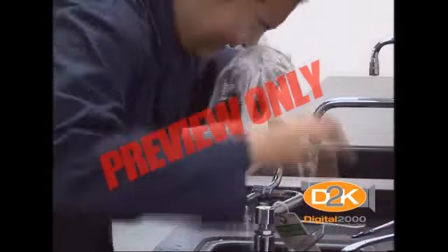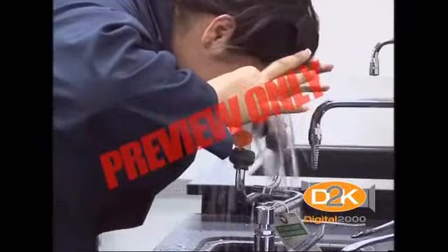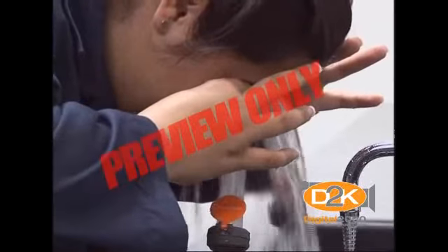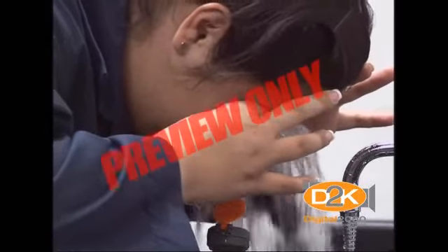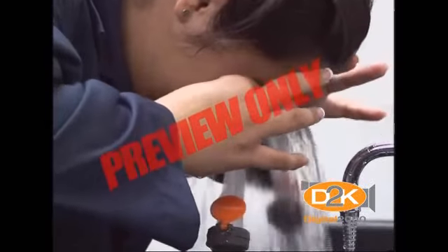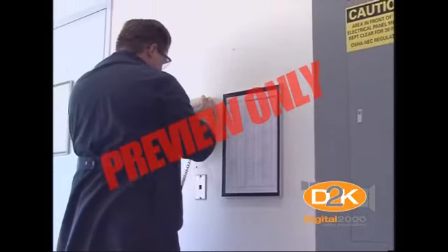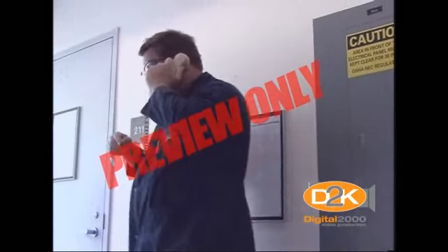If chemicals get into the eyes, immediately flush eyes with emergency eye wash for a minimum of 15 minutes. The eyelids must be held open to wash, and the eyes rotated to ensure proper rinse of eyes. In all of these situations, you should immediately seek medical attention and contact 911. Be sure to carefully explain what chemicals were involved. If possible, take an MSDS with you.